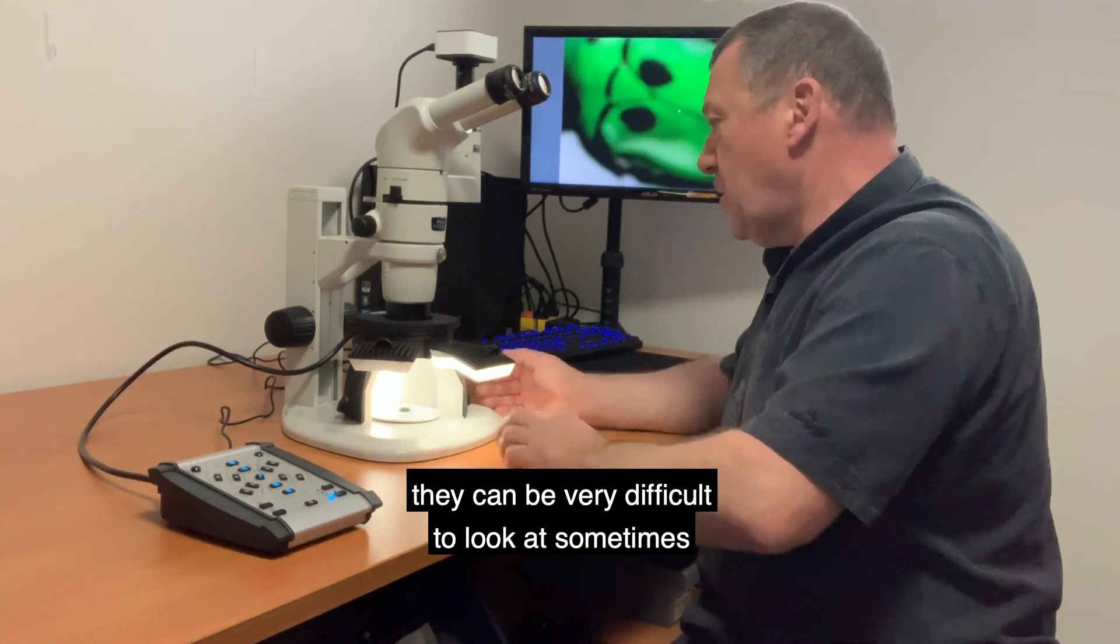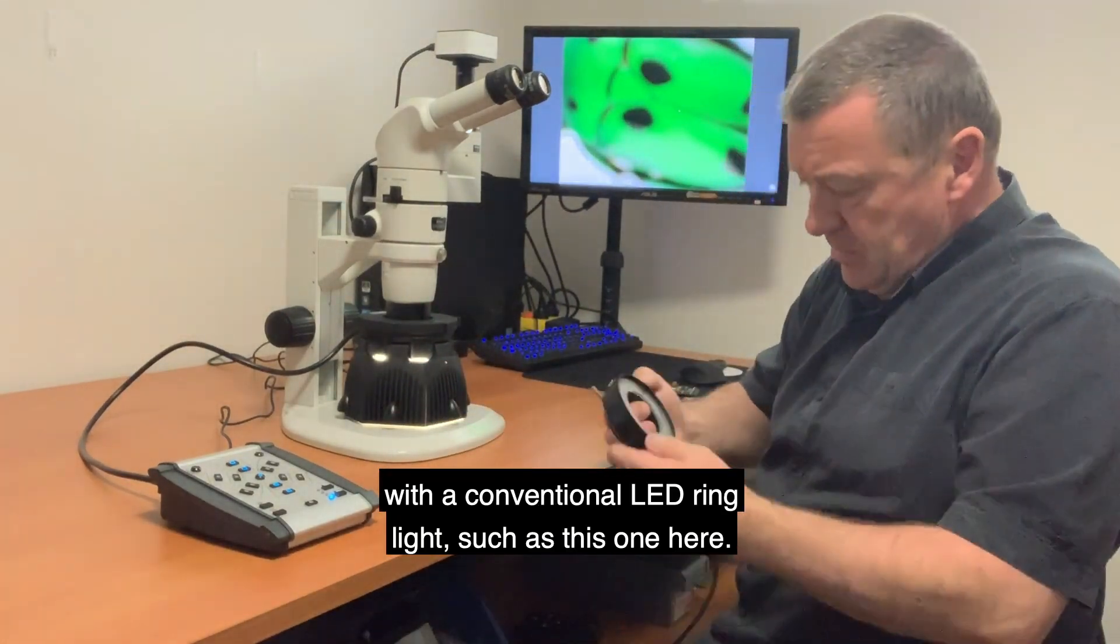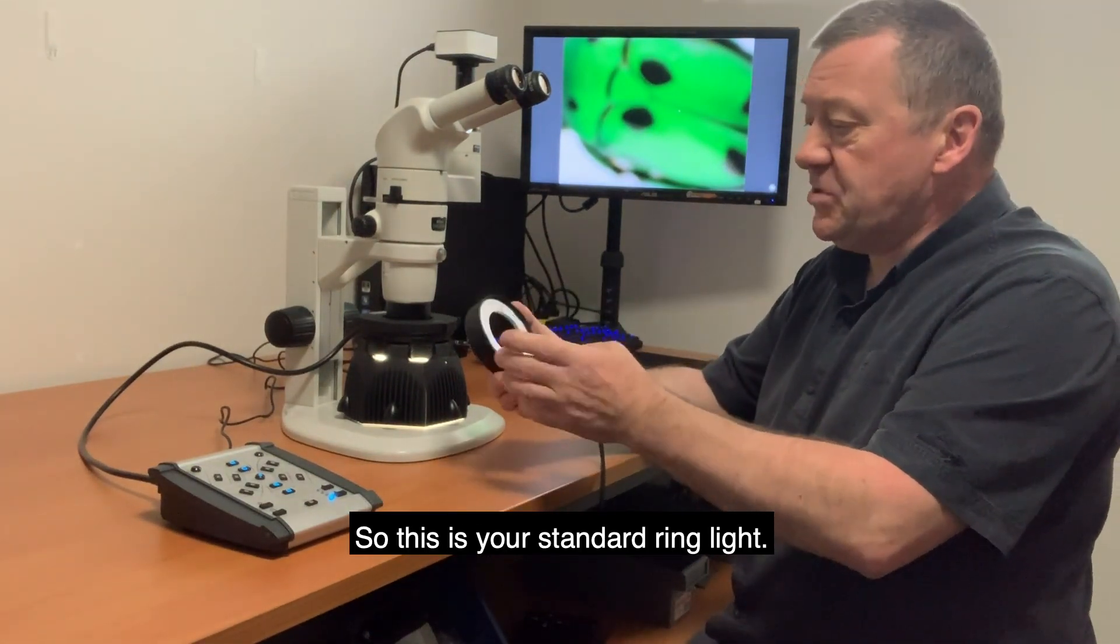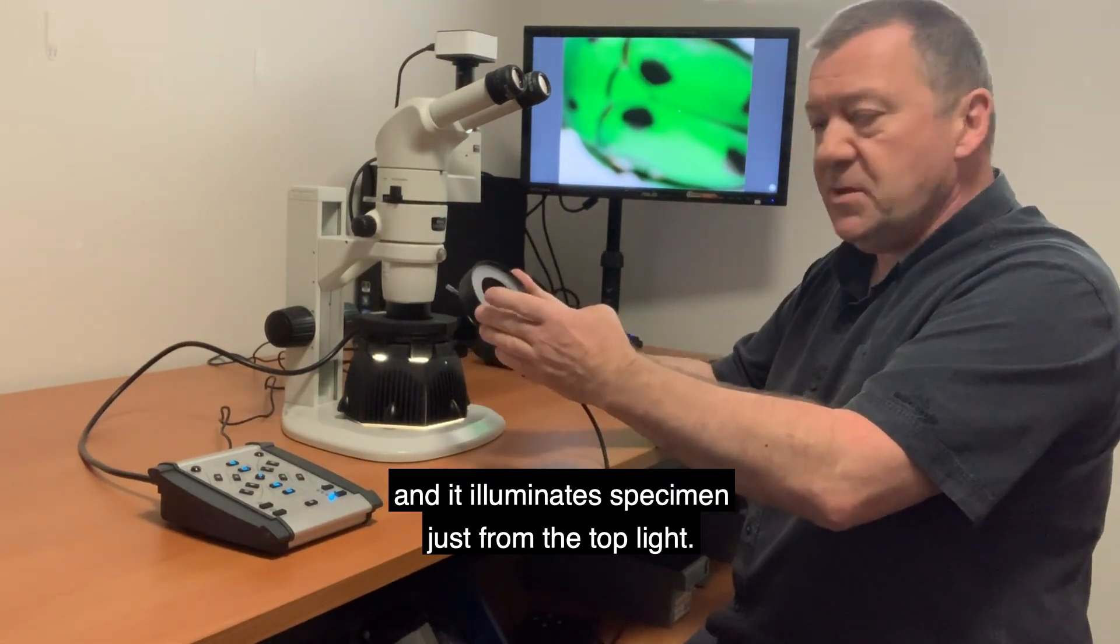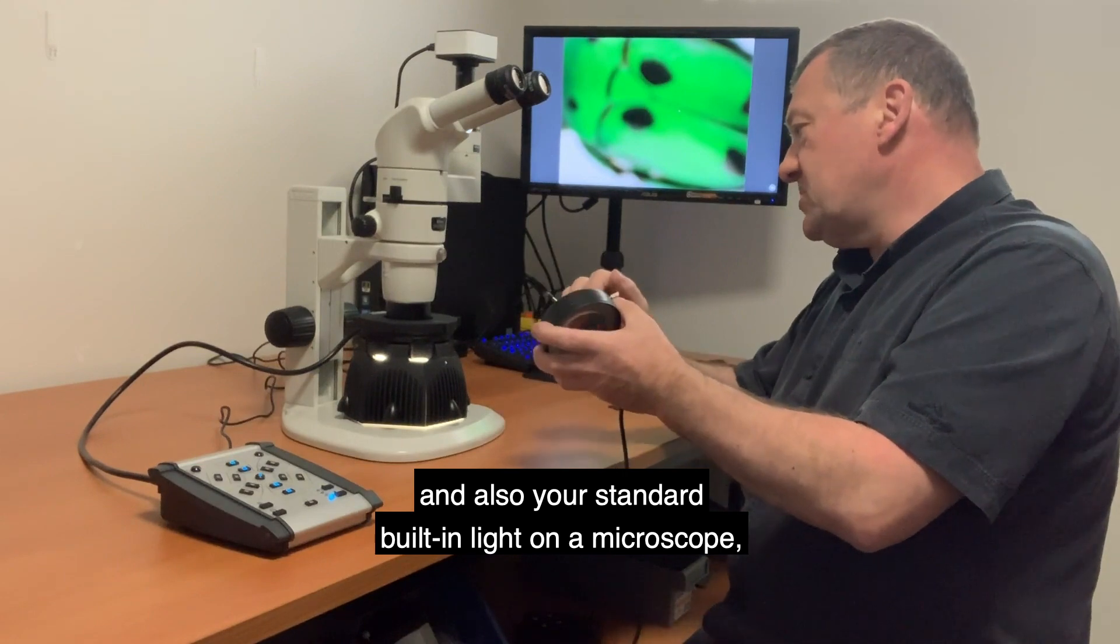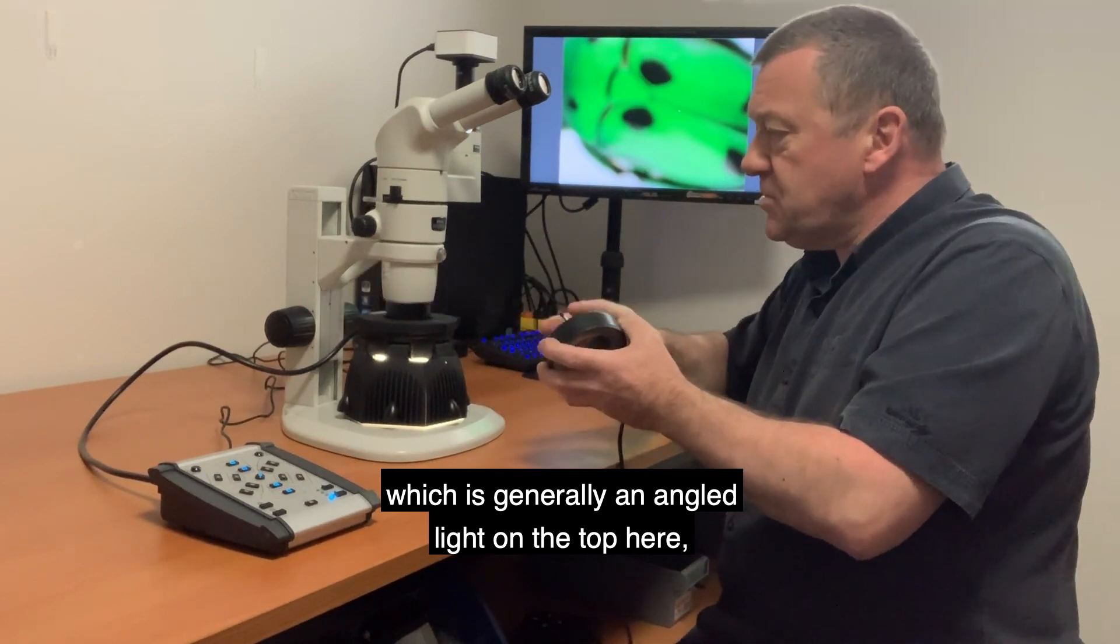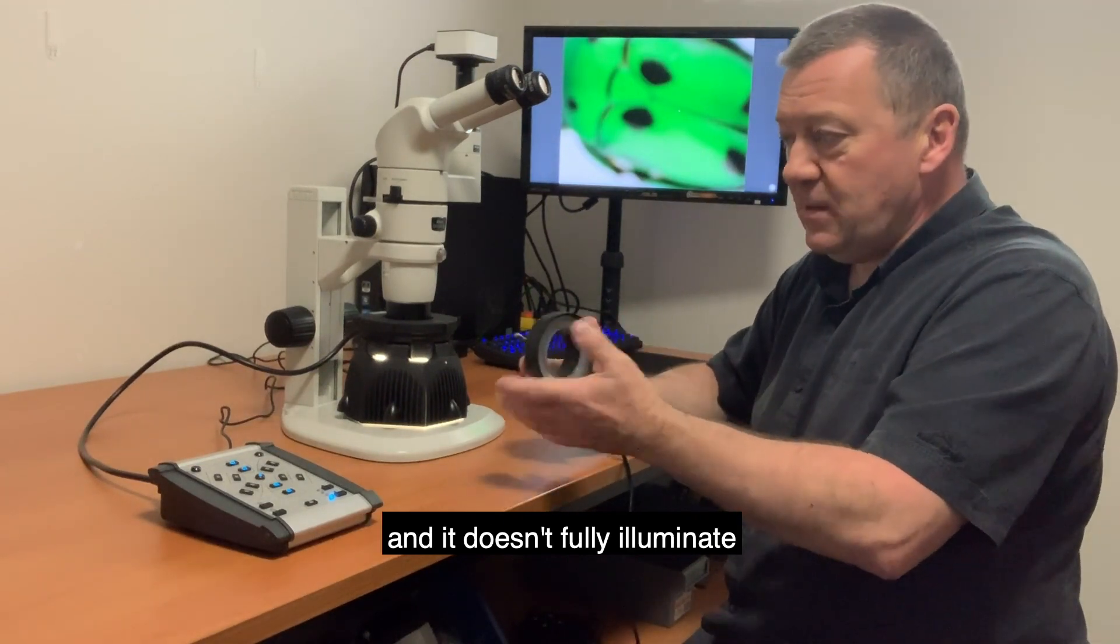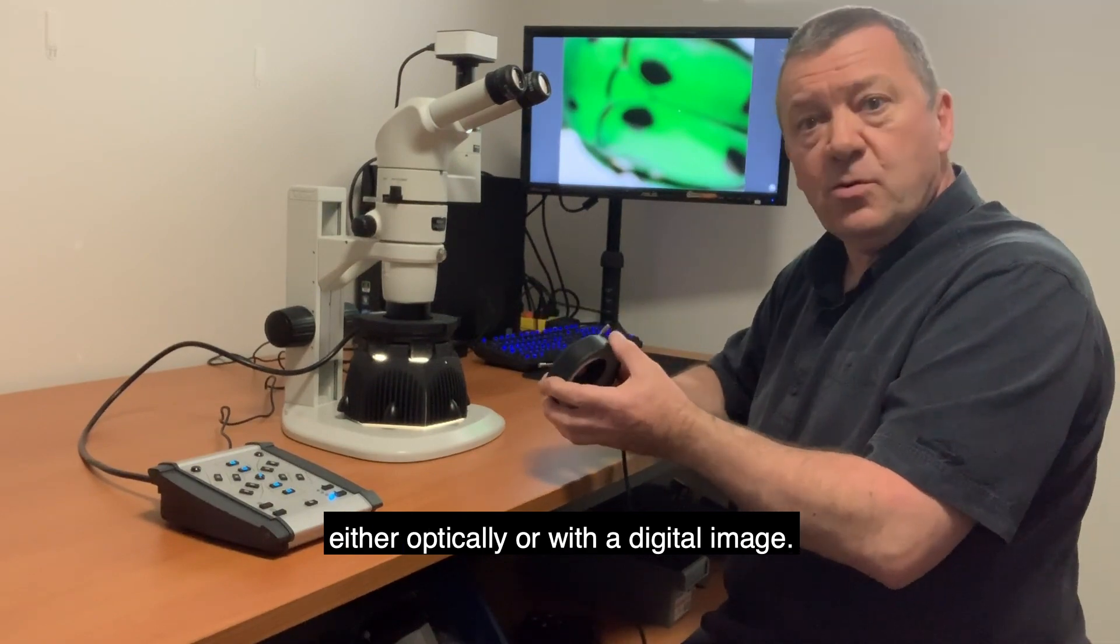This is your standard ring light with 72 LEDs, and it illuminates your specimen just from the top light. The problem with this sort of light, and also your standard built-in light on a microscope, which is generally an angled light on the top, is that it can cast a shadow on your specimen and doesn't fully illuminate everything that you want to show, either optically or with a digital image.